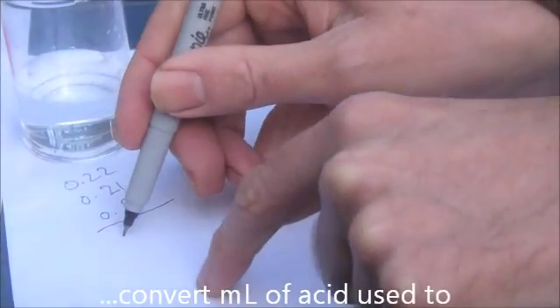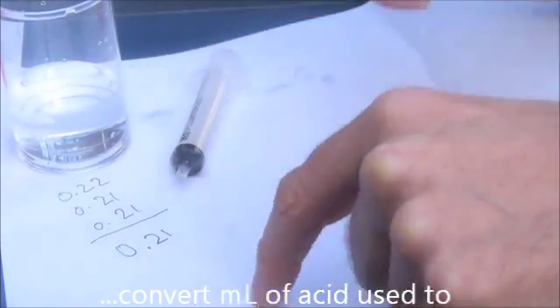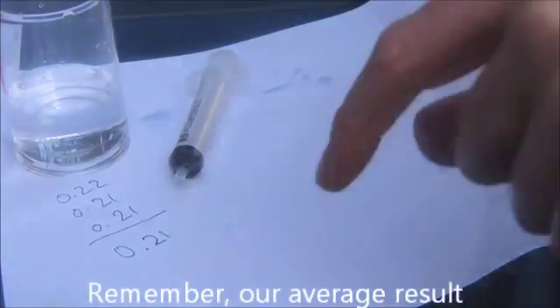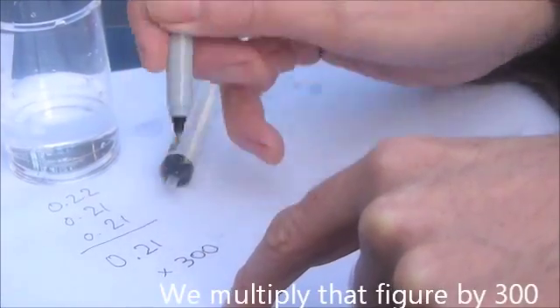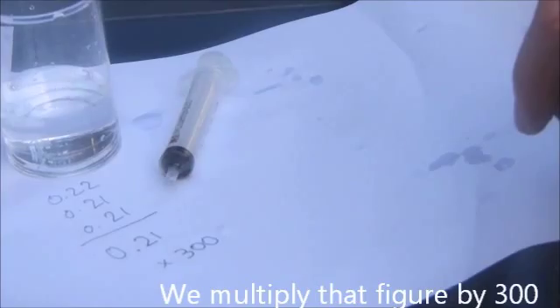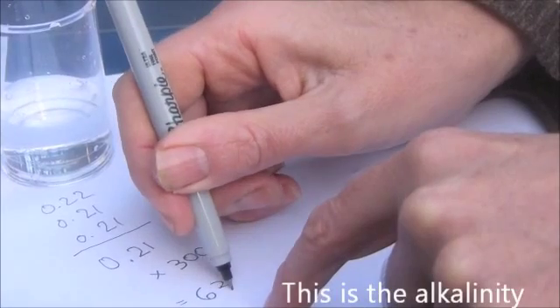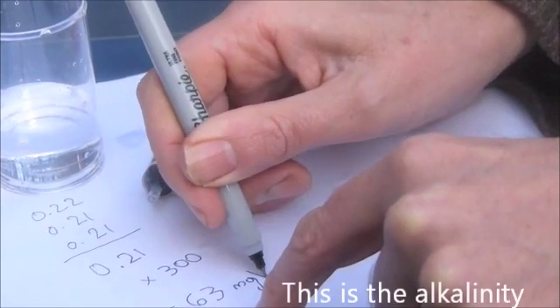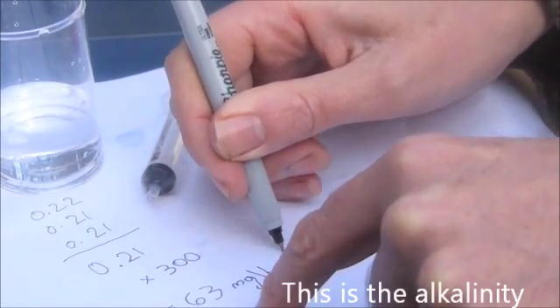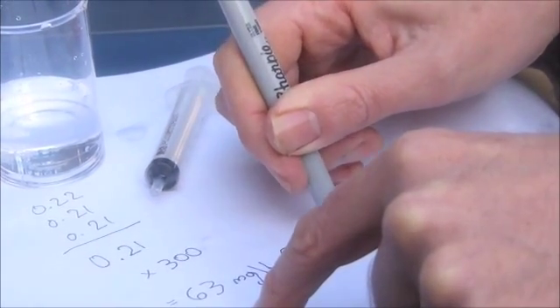So the average of those 3 determinations is 0.21 millilitres. And then you look in the instructions and they say that you multiply that figure by 300, which, if my maths is reasonably okay, is 63. And that's the number of milligrams, trying to write upside down here, per litre of calcium carbonate equivalent there are in the water.